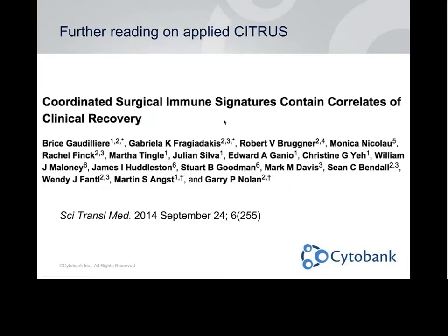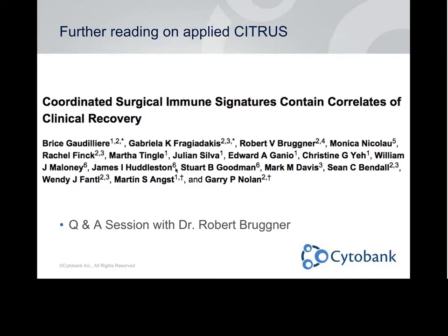If you would like further reading on Citrus, instead of just the debut paper, we have here the reference for this paper that Gabby Fragiadakis will be talking about in just a little bit. Again, this is a great paper. Check it out if you'd like to see how Citrus works in the real world.